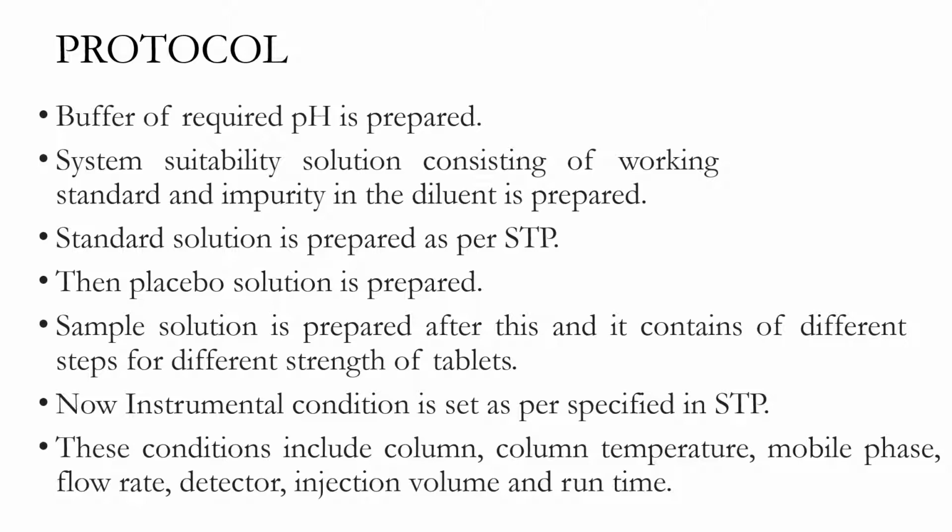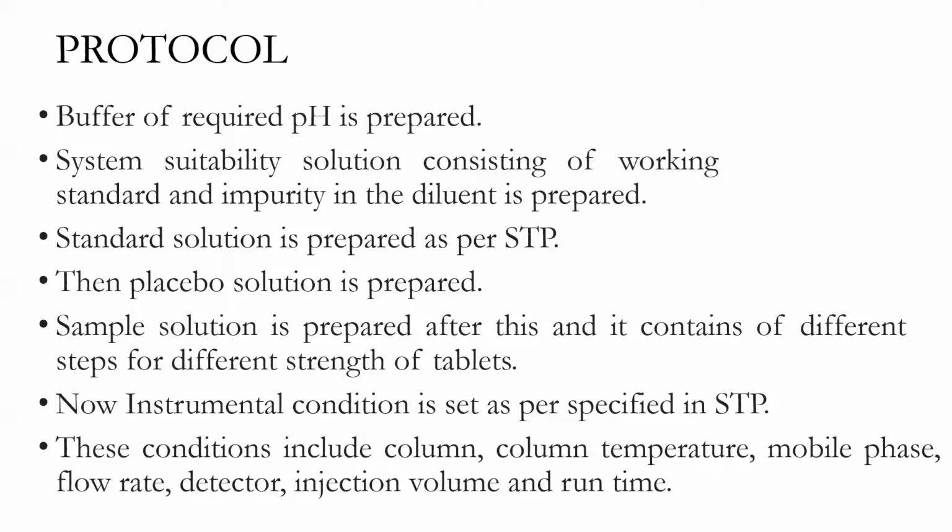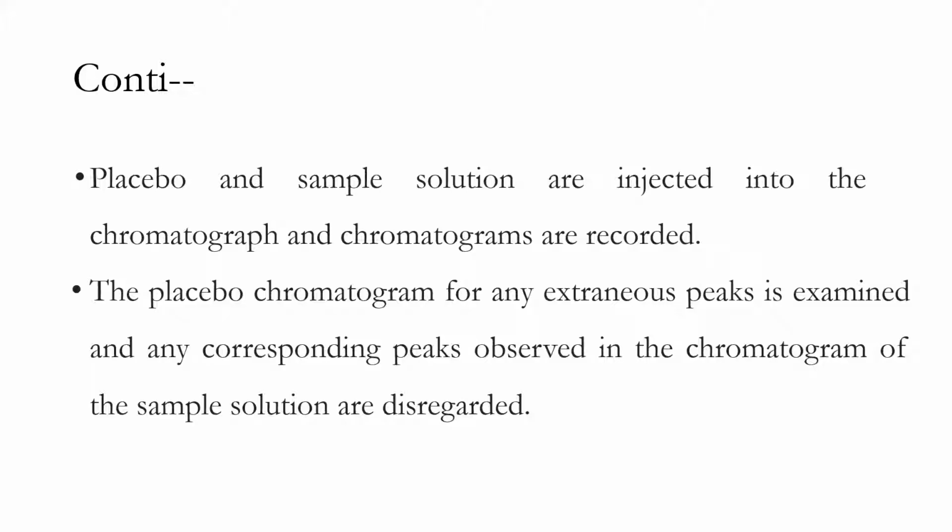Under these conditions, column temperature, mobile phase, flow rate, detector, injection volume, and run time we have to fix. But these are all already stated in the STP. We have to follow it because for a new drug, we have to fix them. But for a drug which is already in the market, we have completed R&D. For those drugs, all these things have been prepared in the form of STP, standard test procedure. We need to follow that.